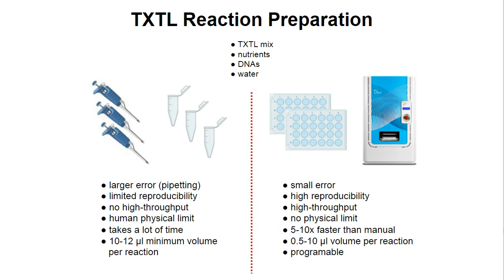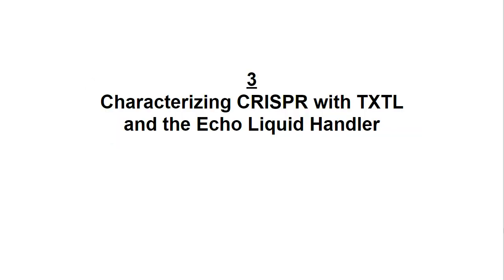With that we conclude the second part, and I will let Aset present the third part and give you some examples of using cell-free gene expression and the Echo to characterize CRISPR technologies. Thank you, Vincent. So, CRISPR technologies.